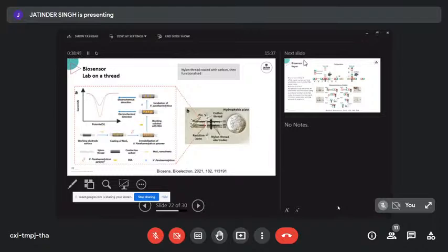So we can use them as a fluidic vehicle themselves and use them to do bioassays. It's not as big a field as microfluidics, but it's been around for about 10 years now, so it's probably there to stay. It's another nice example of a budget way of doing advanced chemical analysis using cheap materials.